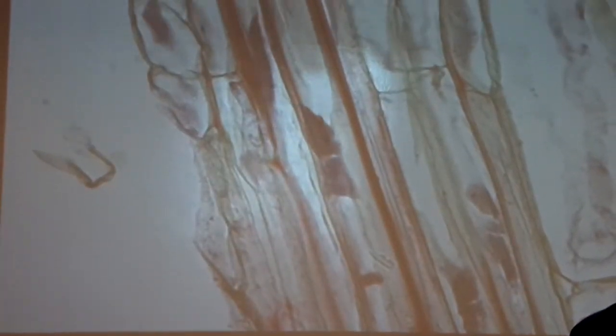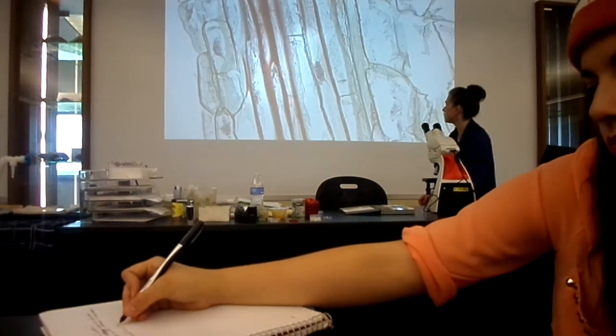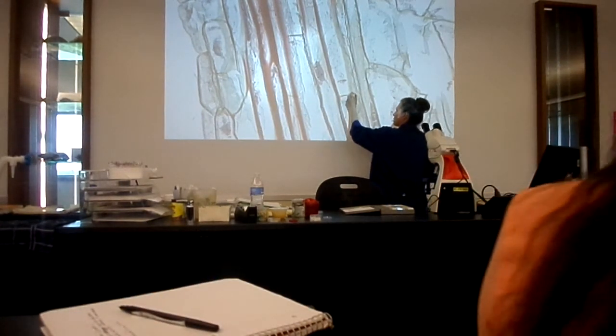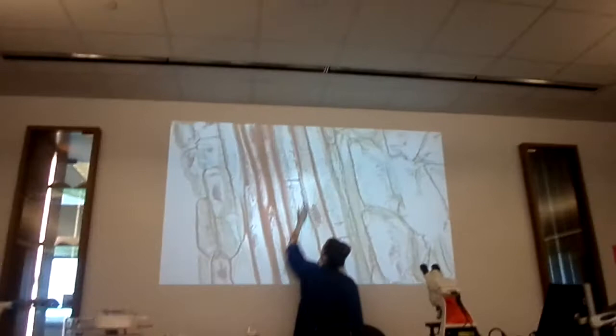All right, so what we see here is phloem, right here. Phloem is living. When it conducts its sugars, it is a living tissue. And what I want you to notice is, here are my cells. My cells are all kind of stacked. They're very similar. And I want you to notice these little divisions there. There's one up there. There's several.